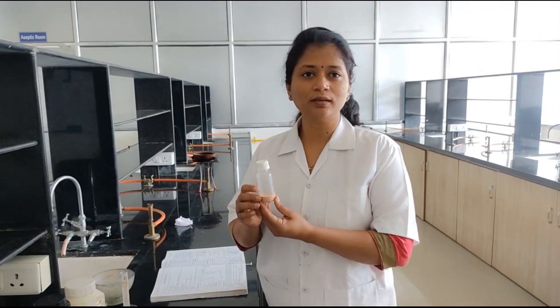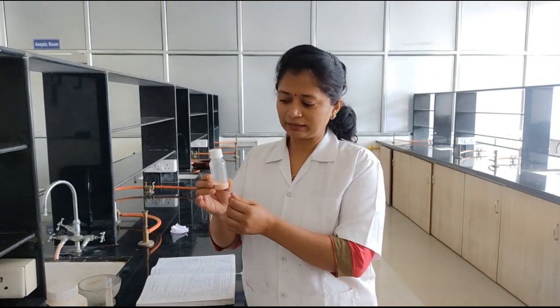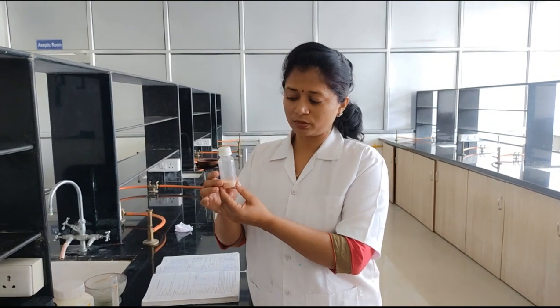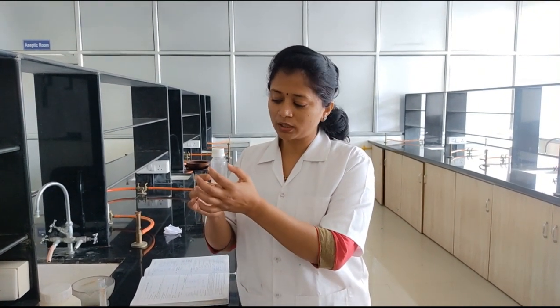Then we move towards the label session. While labeling our preparation, we have to keep in mind that the label should not be too big or too small. It should be of appropriate size. It should give the proper appearance to our preparation. Let's move toward the labeling session.